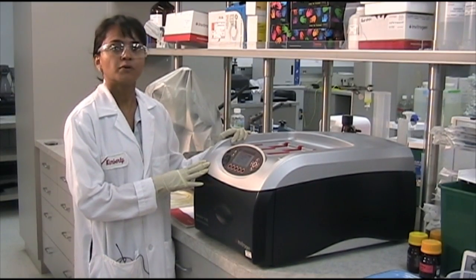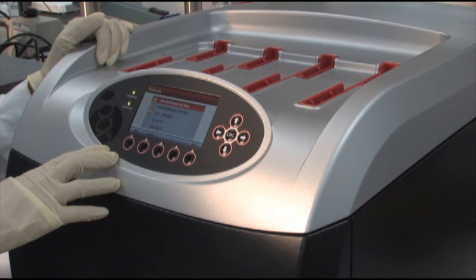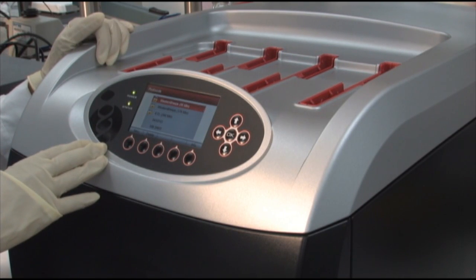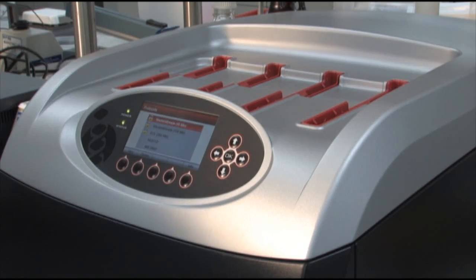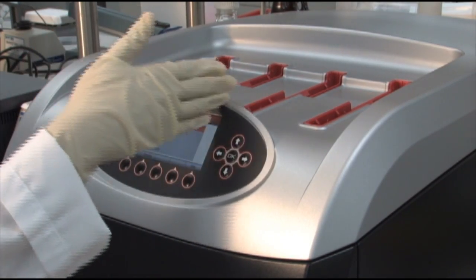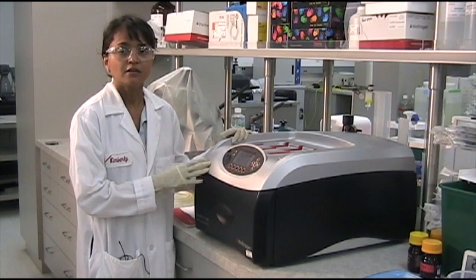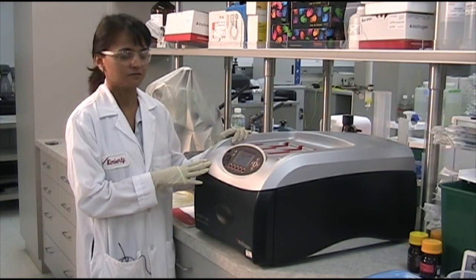This is the Bench Pro 4100 Western Processing Station. The instrument comes with two pre-programmed Western Breeze protocols, one standard ECL protocol, or you can custom design your own protocol. It allows you to automate your Western experiments. The instrument has four slots that allow you to do four blots simultaneously. You don't have to switch out your reagents and you can continue to use the protocols you currently use.